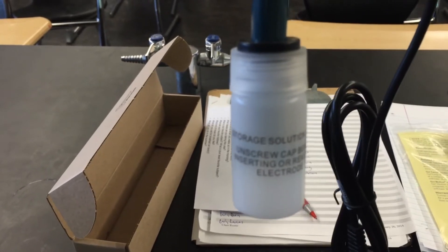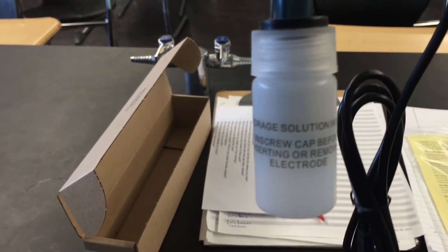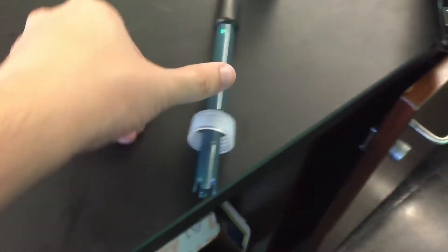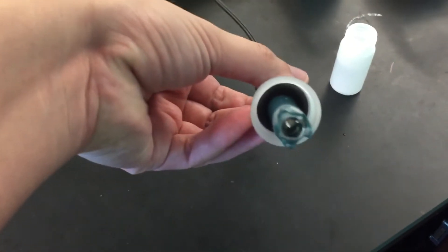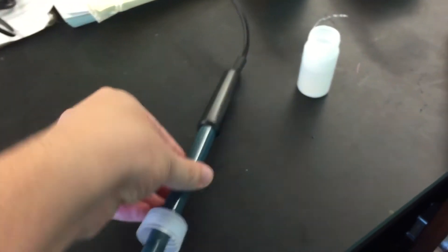Like it says, storage solution, unscrew cap before inserting or removing the electrode. And so when you remove it, it ends up looking something like this. You can actually see the glass electrode bulb here at the bottom.